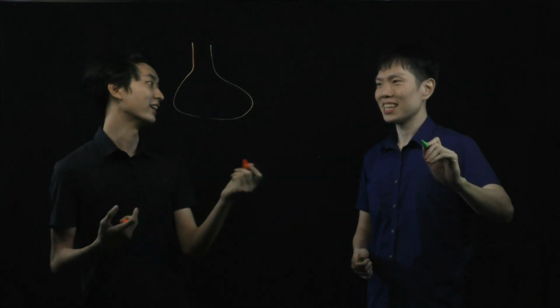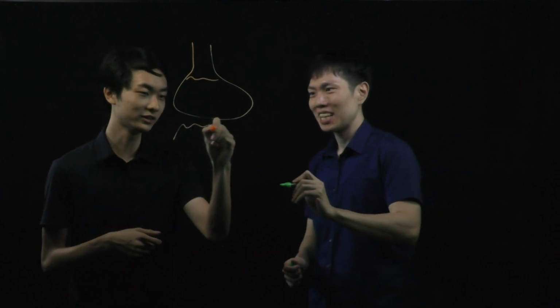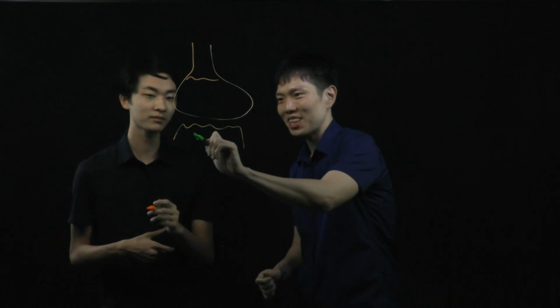Right, so let's say in the lab practical, we have a conical flask over here, and you have some liquid inside. And so, let's say, we boil the liquid.